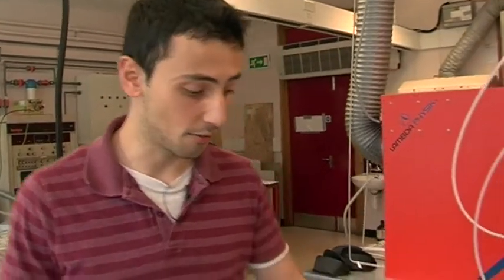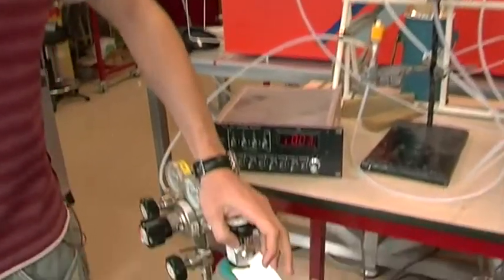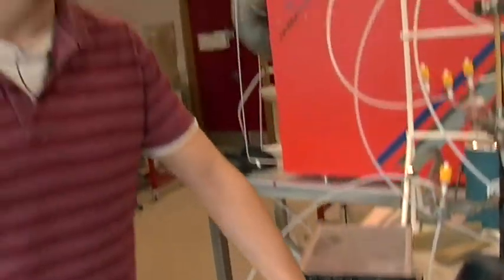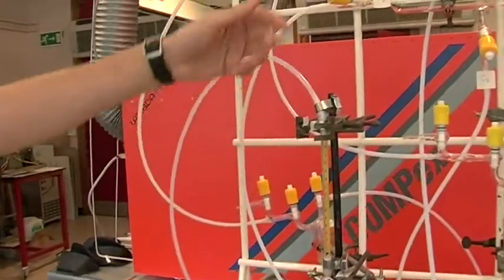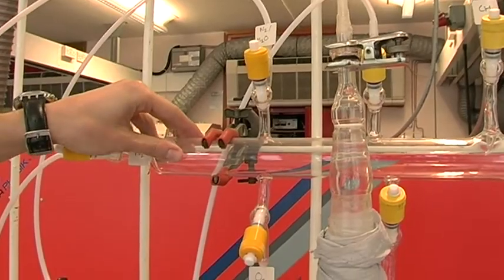What we do is look at reactions that occur in the atmosphere and study their rate and mechanism. To do that, we actually use gases. These are precursor gases contained in the cylinders. Then we flow gases through these Teflon tubes into a mixing line, this glass vessel.